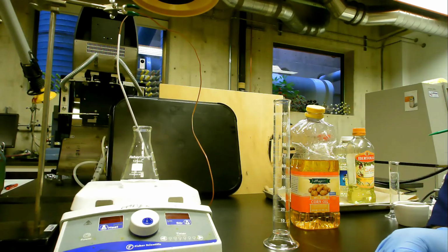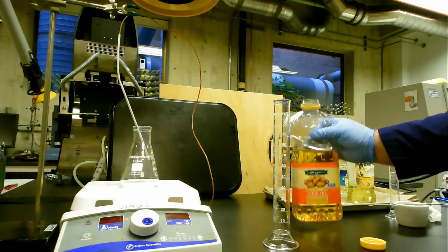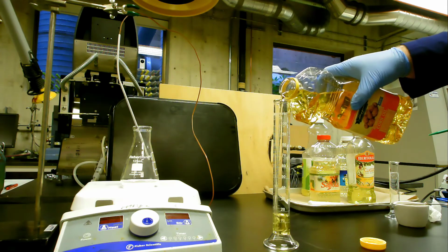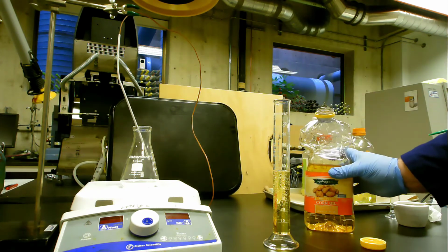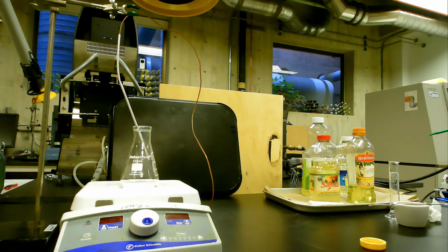The next step is to measure out our chosen cooking oil. We have chosen corn oil for this. We need 60 milliliters. We're measuring it into the 100 milliliter graduated cylinder. Remember to measure to the bottom of the meniscus. After we've measured this out, we're going to add it to our Erlenmeyer flask, which contains the sodium hydroxide, the methanol, and a stir bar.